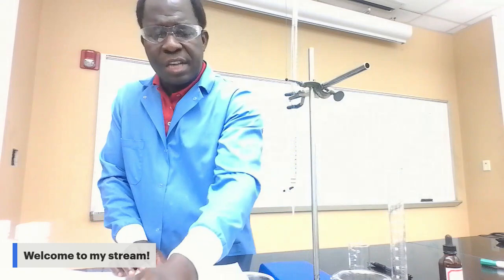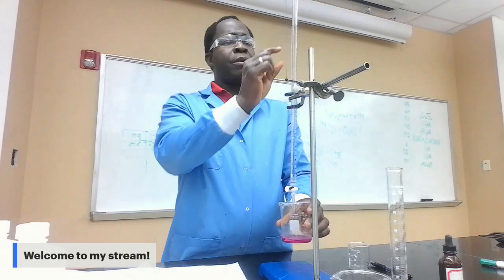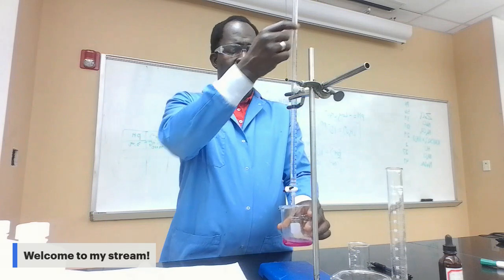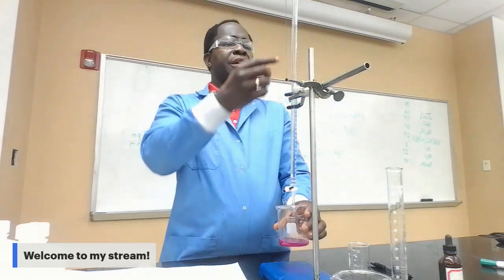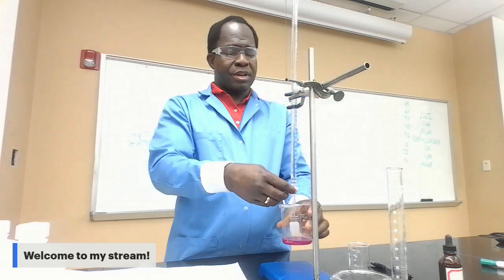Now, when you're done with this beaker, put the beaker on the side, get the other one, and titrate the 20 milliliter of Ca(OH)2 inside it by adding the HCl by increments of 1. Now that I know approximately the volume of HCl I used for the first titration, I can go ahead and move faster.